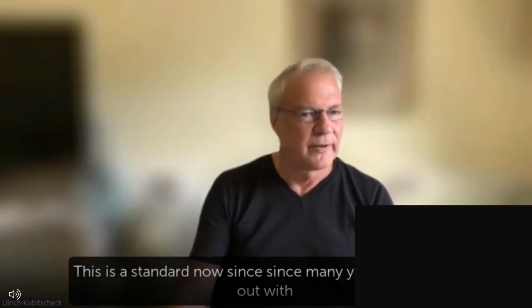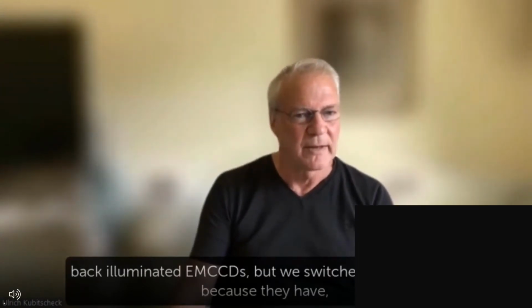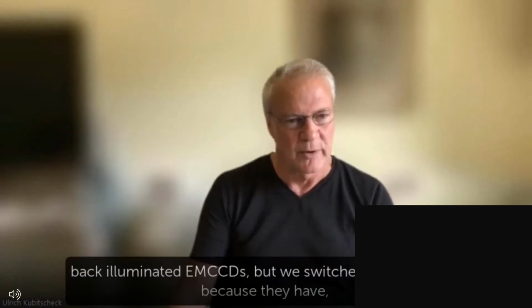We started out with back illuminated EMCCDs, but we switched to the sCMOS.